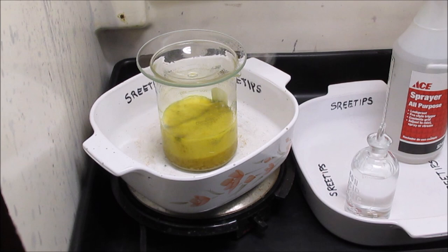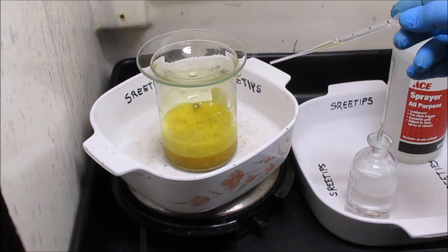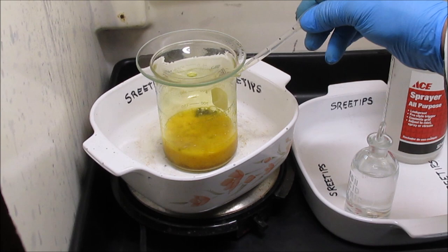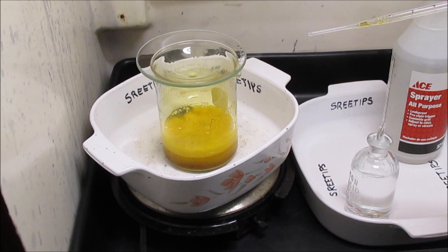I see why we want to add it slowly, because it's real hot right now. I only got about half of that in, a 1/2 mL of nitric there. Add it real slow, drop by drop. I think we're going to get everything to go into solution here with just adding the nitric acid to this hot hydrochloric acid and placer gold mixture. Should be real easy. Save a lot of time.